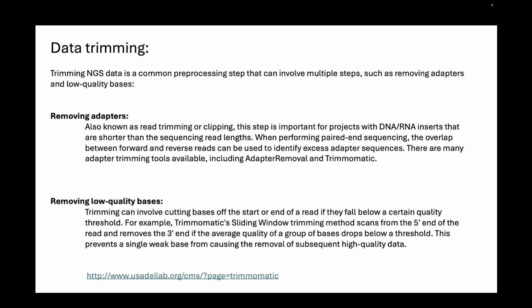Till now, we have checked, from the signal till generating a good sequence file, what the different steps involved are and what the different kinds of softwares are that you can use to identify and remove certain contamination and other stuff. But till here is basically just getting your sequence file ready. If you do till data trimming, what you have is basically a FASTQ file with good quality bases, no duplicates, and you have removed contamination and everything. So basically what you have is a very good set of data with good quality reads.